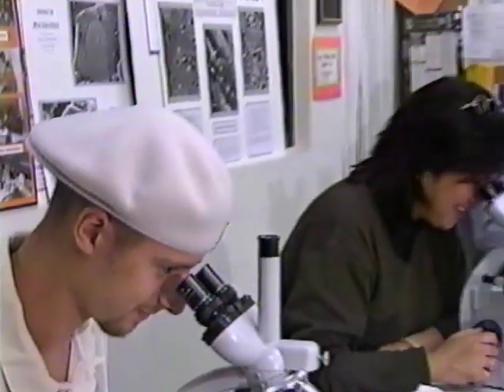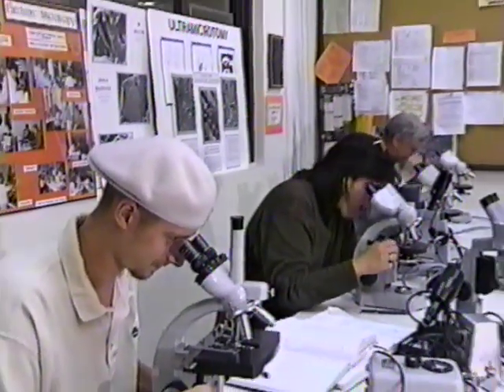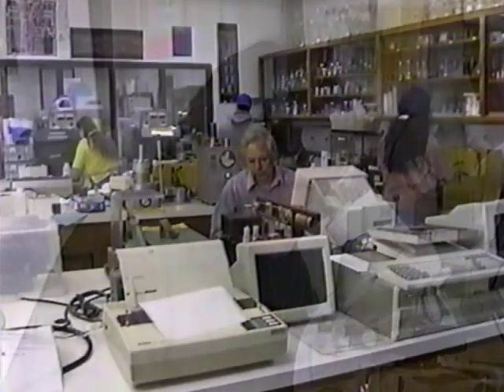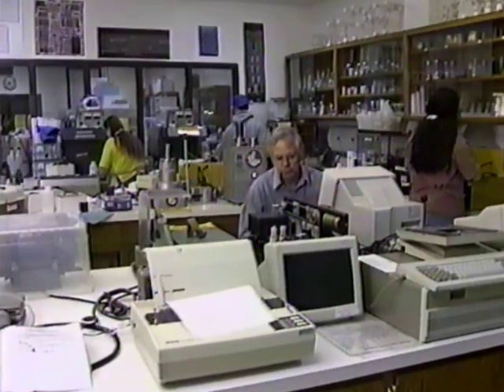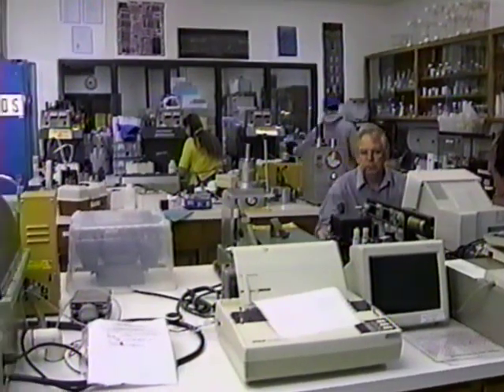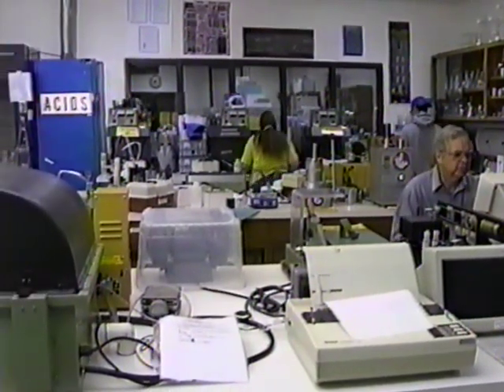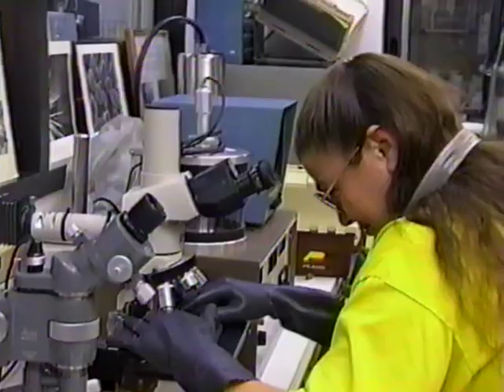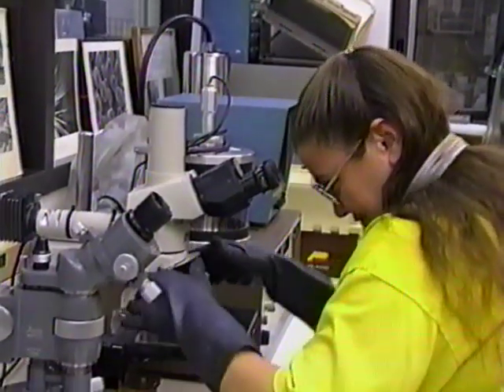Now, Judy, one of the things that you might want to do is to walk through and give our audience a little bit of an idea of what we're watching. This is in a preparation area, and the students are looking through light microscopes. Right now you see the computer systems. Most everything is digital nowadays, so even our light microscopes are digitized into computers so that we get the results out.